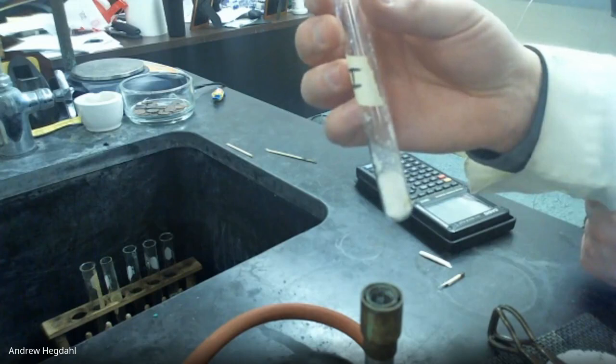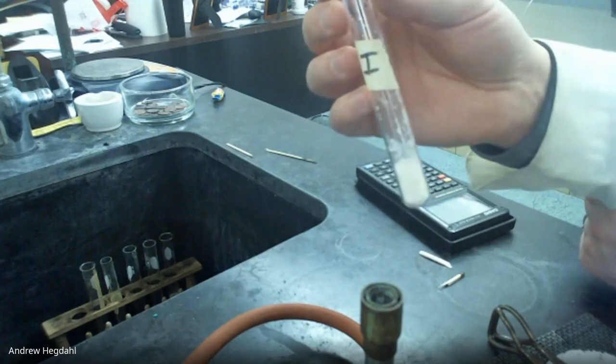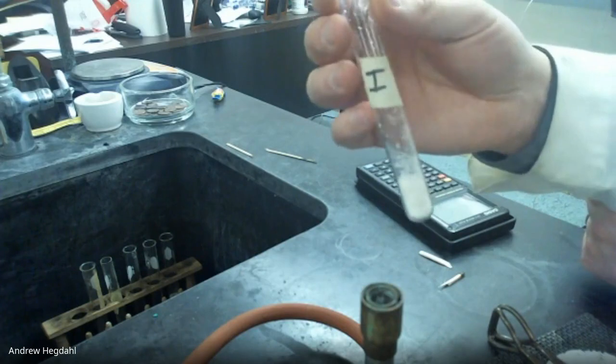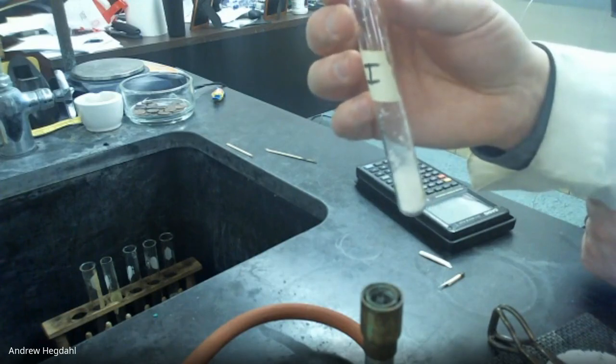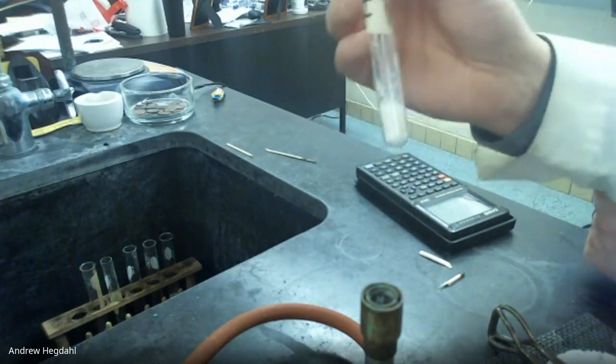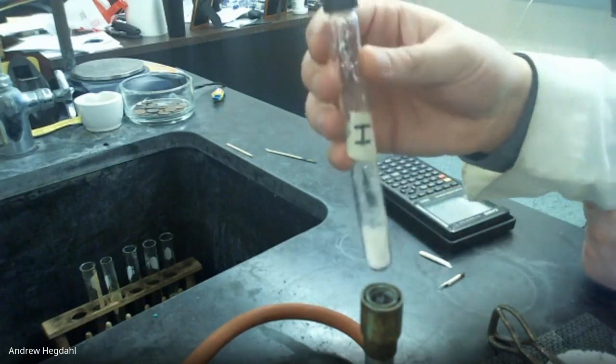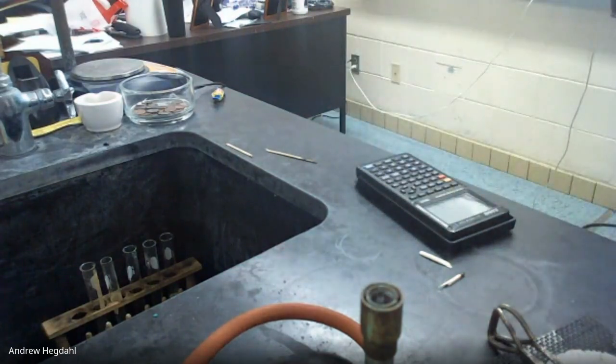So now what we're going to do is run through our samples, and people are starting to get ready to light up their burners. So I'll shut off the lights and we'll go through the samples. Once we've done that part, you'll have all the information you need to finish the rest of your lab.